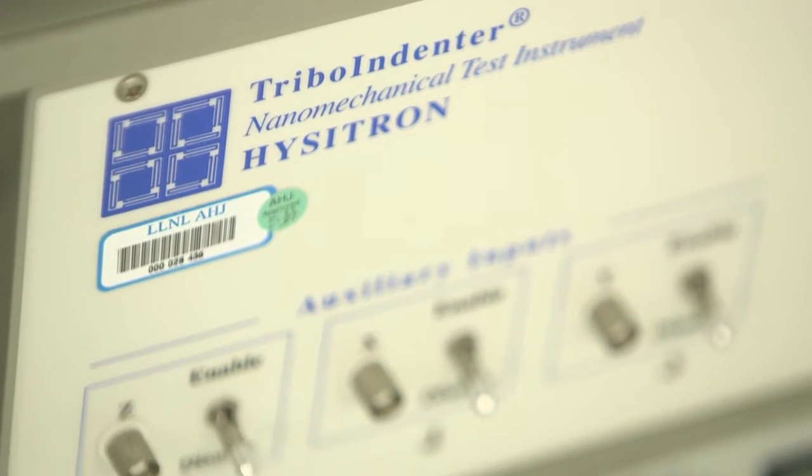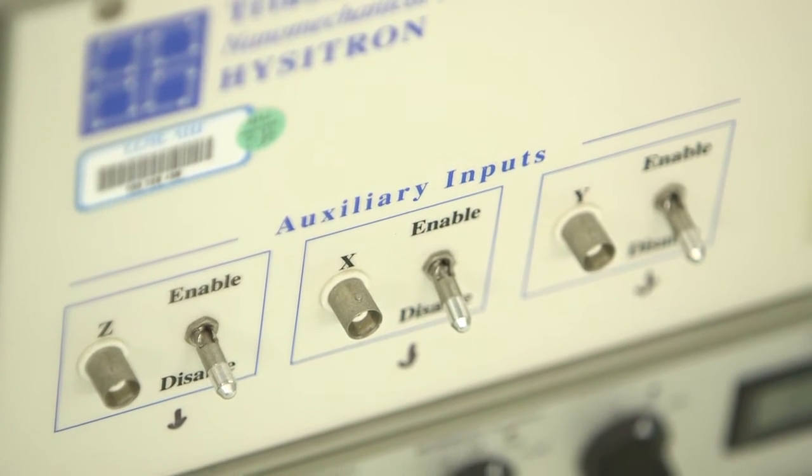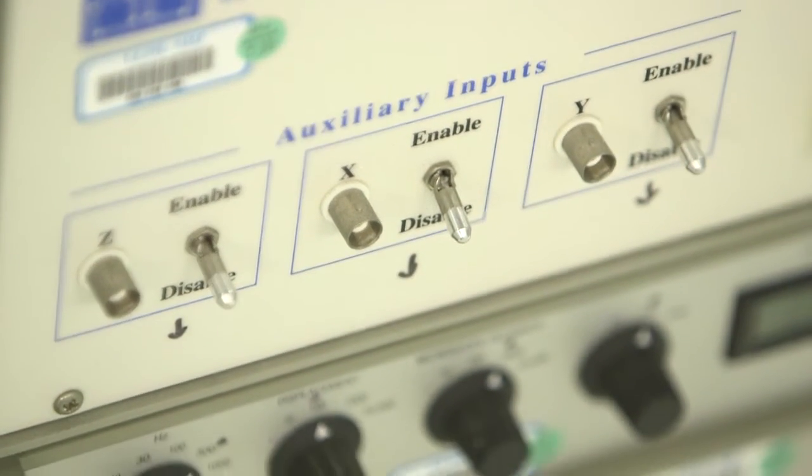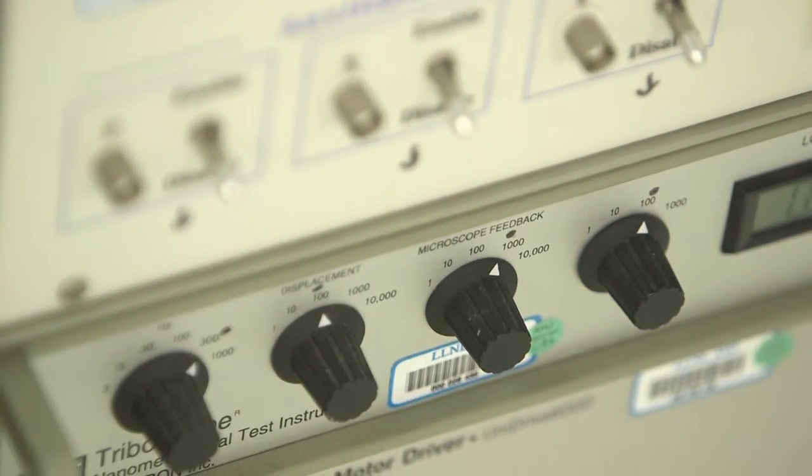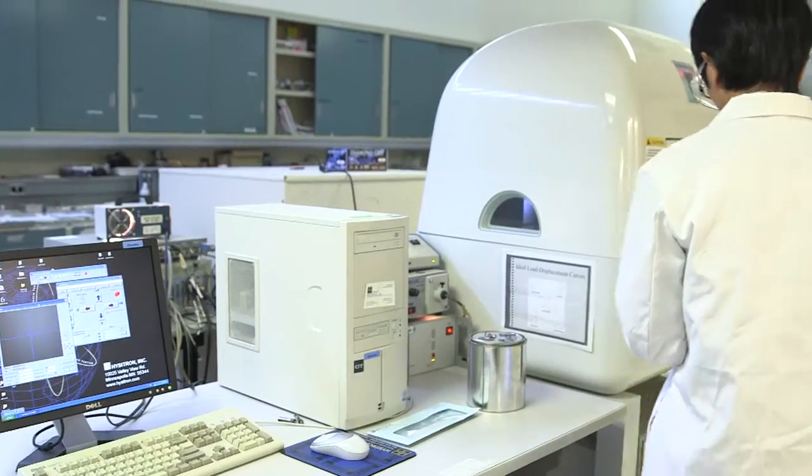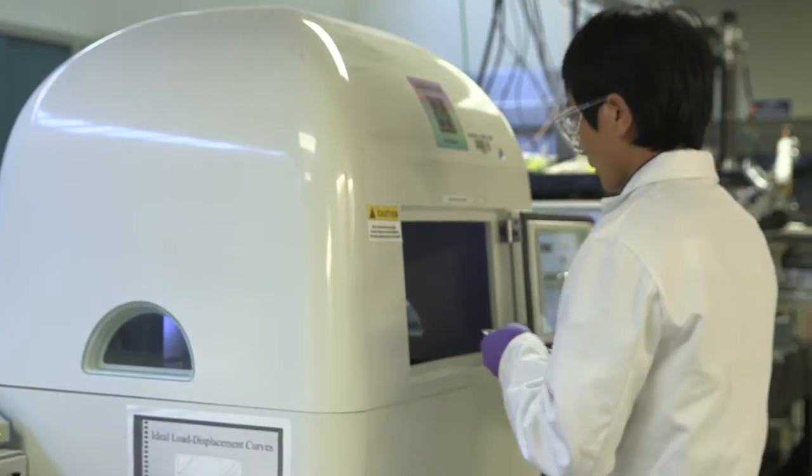Nanoindentation is the perfect tool to understand the mechanical properties of those materials. In particular, it's very versatile as well as very powerful. You can test elastic modulus, hardness, strain rate sensitivity, as well as activation volume of those materials.